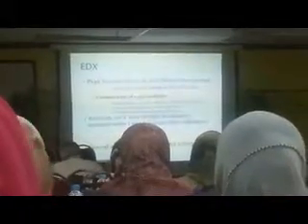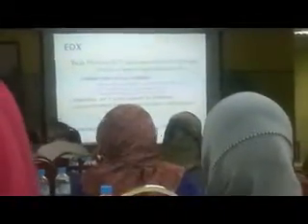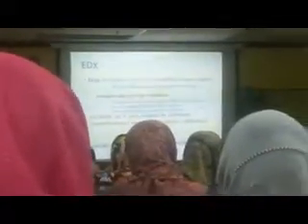What are they? The peak position on the x-axis identifies what element it is. Each element has different energy for the characteristic X-rays. And intensity on the y-axis is related to the concentration. If you have aluminum and copper in the alloy, and aluminum is higher, of course the intensity of the characteristic X-ray coming from aluminum will be much higher compared to copper. And using appropriate calibration files given by the supplier, the machine can calculate exactly how much copper and how much aluminum is there in the sample.